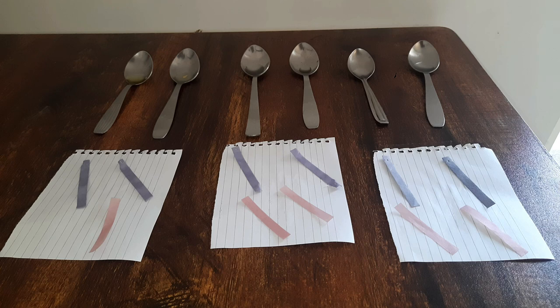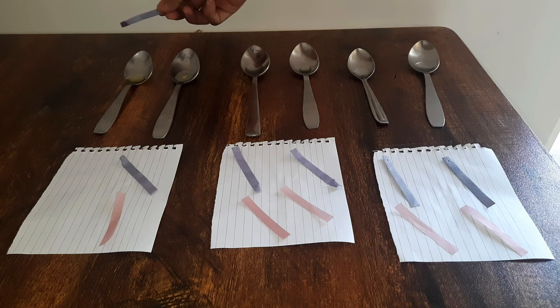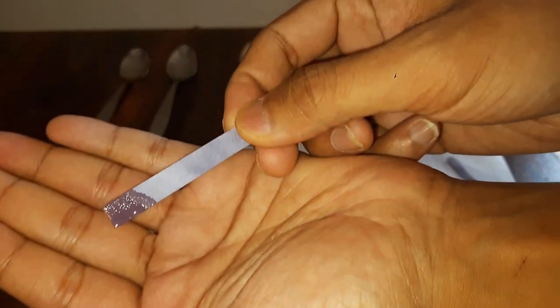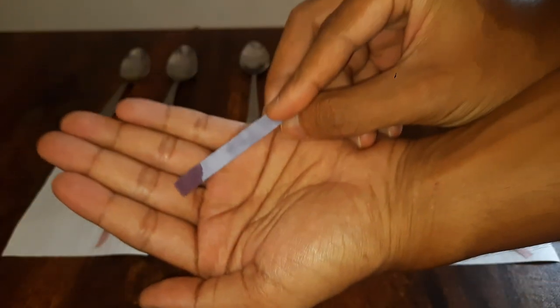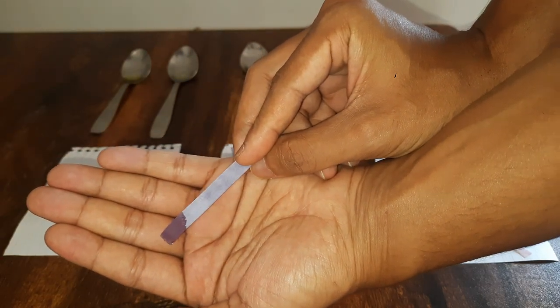Now let's bring the blue litmus paper in contact with the detergent. We see there is no color change. That means when blue litmus papers come in contact with bases, they do not show any color change.